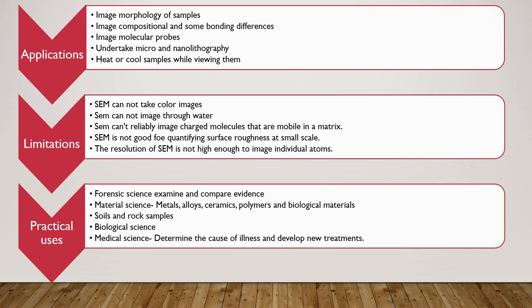Atomic force microscope is more useful for this task. Measurement involving height cannot be taken directly in SEM. Generally, SEMs are not used for experiments involving liquids, chemical reactions and air gas systems, although some specialized machines and sample chambers do allow for these experiments.